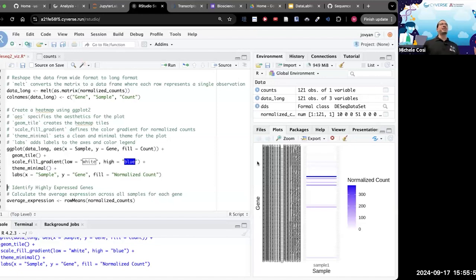But imagine yourself not having 4 samples. Imagine yourselves having 20 samples. Imagine yourselves having trimmed some of these samples, and having gone through this whole process, and you'll probably see a different set of genes being highlighted.